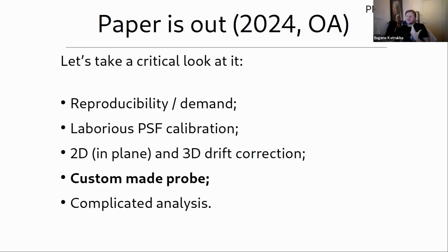But if you are not such a big fan of microtubules as I am, or you want to use something else, you can use DNA-PAINT, and that works really well. You can use STORM; any way you make your probe link should be fine. It's not such a big deal. And I think modern lattice light sheets even come with two cameras, so you can do simultaneous recording.